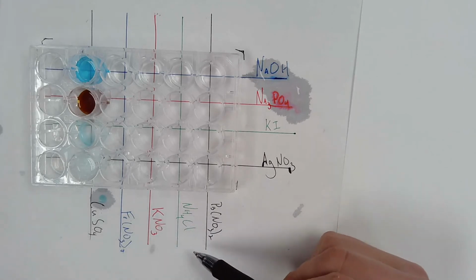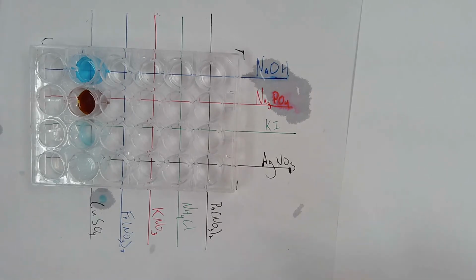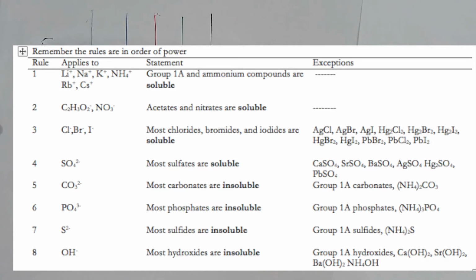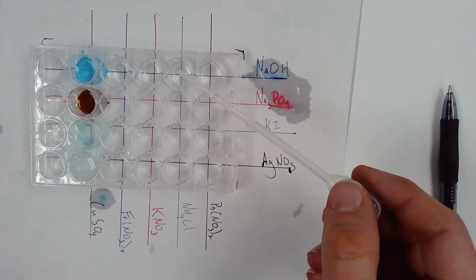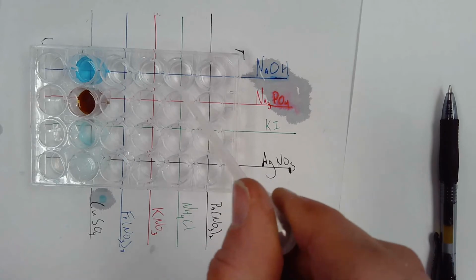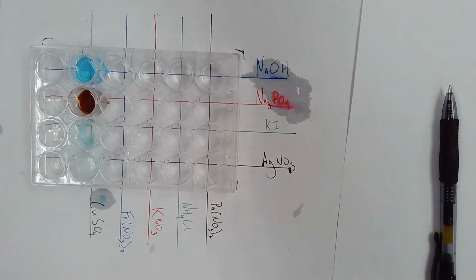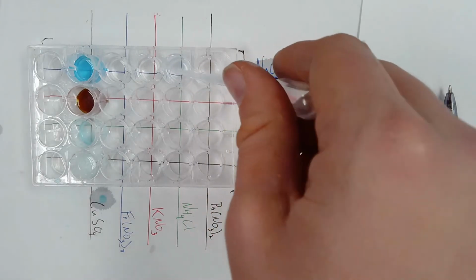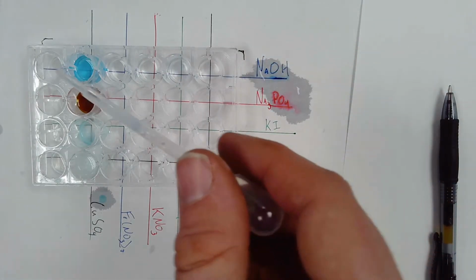Now, I can throw two of these out immediately because without any exceptions, they are always soluble. So pick the two things that I know won't make precipitates. All right, let's prove that to ourselves. Here's some ammonium chloride. No obvious color change. I'm going to take a clean pipette here, just pull it back up. Nothing there, right?